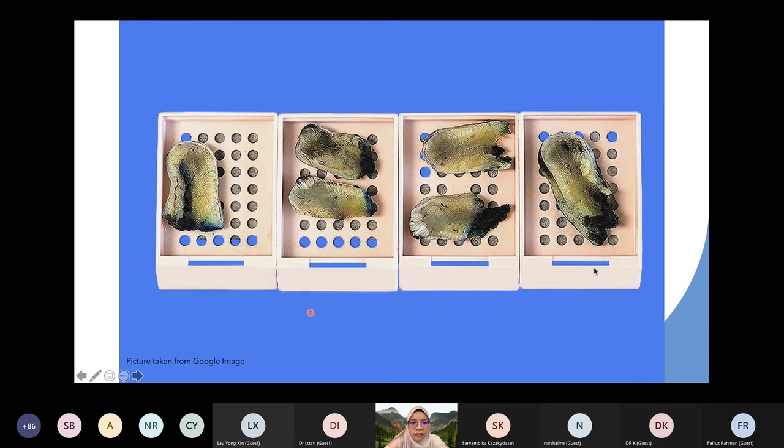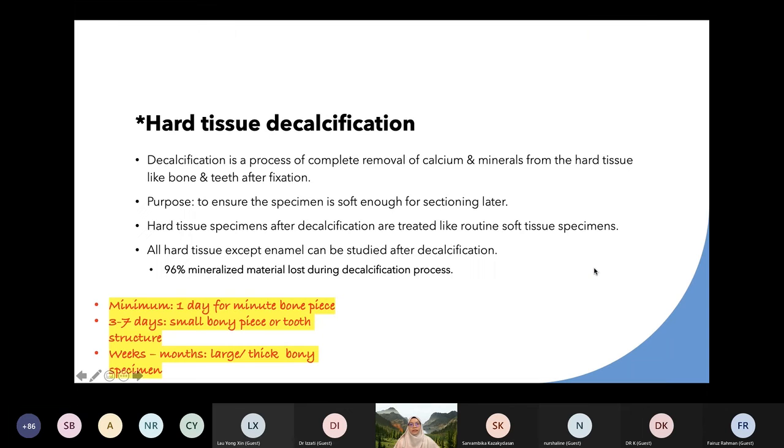So this is an example of how we arrange the tissue sections just now. The sections with surgical margins will be placed in different cassettes here and here, and the rest, or the middle part of the tissues that contain the tumor, can be placed in a few other cassettes that fit. And now the tissue specimen is ready for the next stage, which is tissue processing.